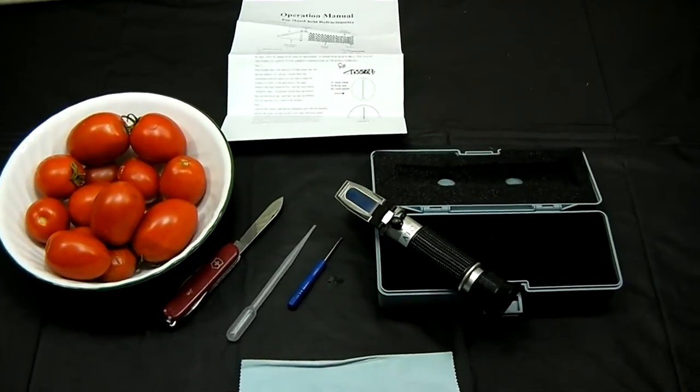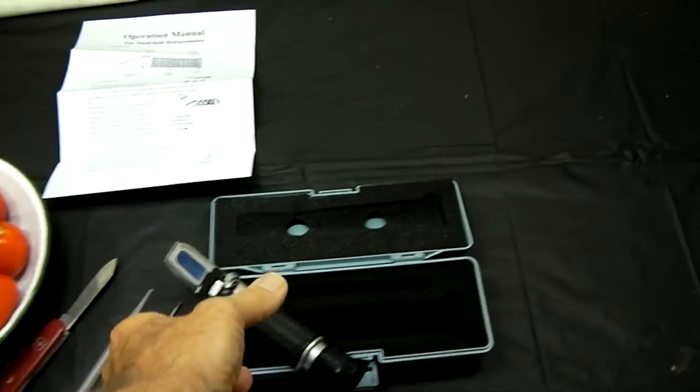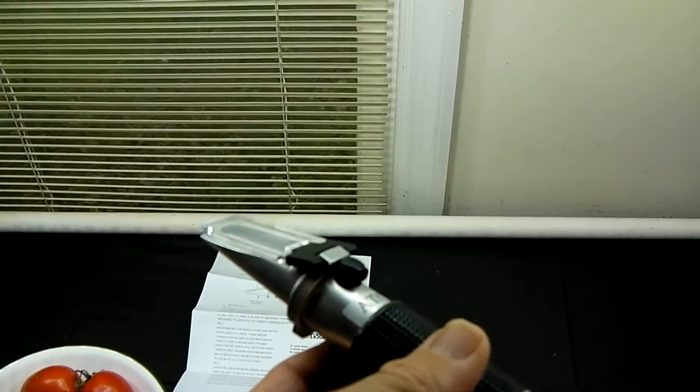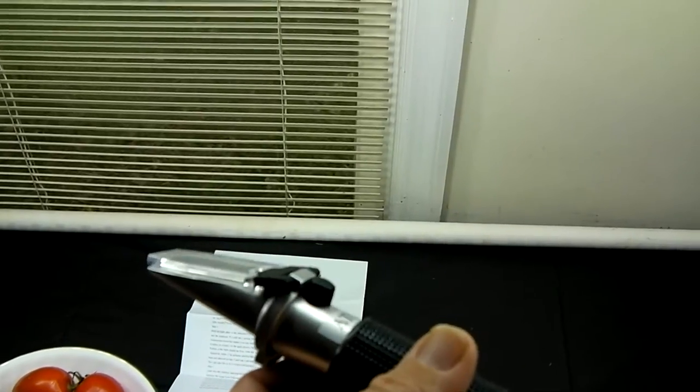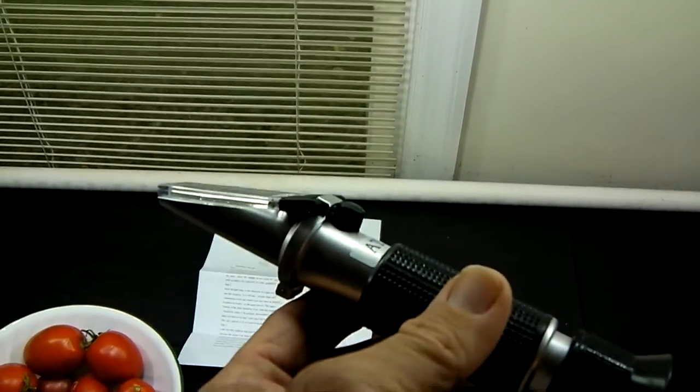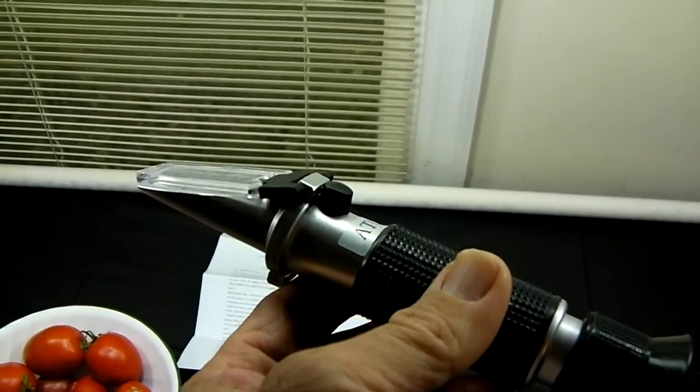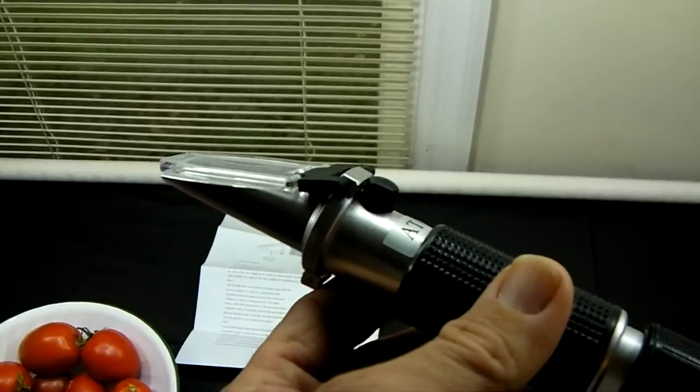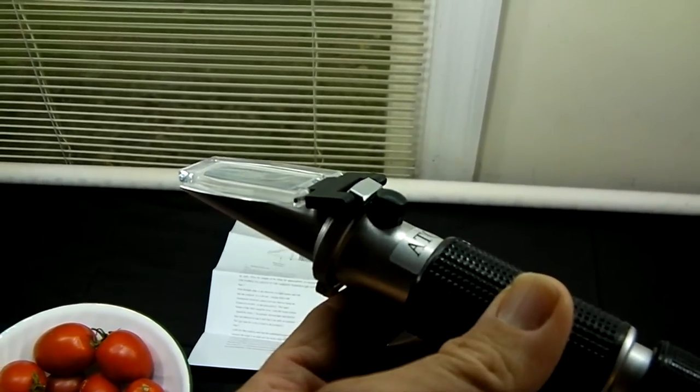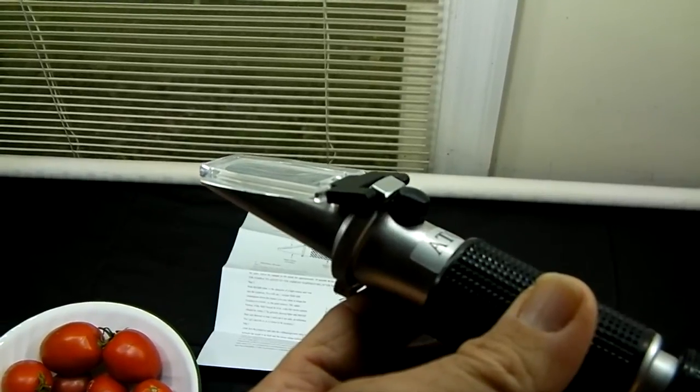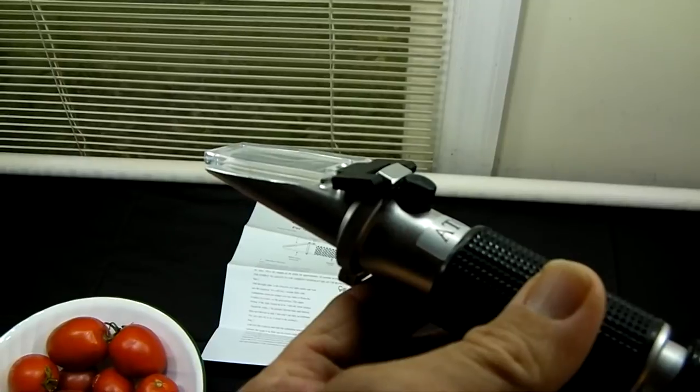Just to give you a quick and dirty explanation of how a refractometer works, basically it's got a prism inside there, and what that does is it bends the light like any prism does, how it will break your white light into all the different colors, the wavelengths. When you put your sample on there, when the light goes through the fluid, it's going to be an aqueous solution - water and sugar. It bends the light and then comes out on that scale to show you percent by weight. So if this scale showed say 10%, that would be 10% of the weight of that sample in sugar, and that would be a pretty good number for just about anything.